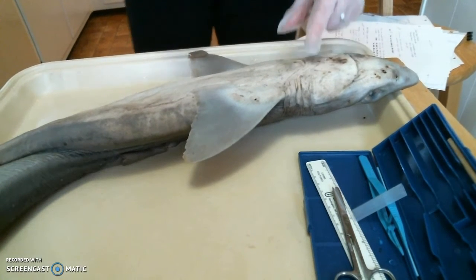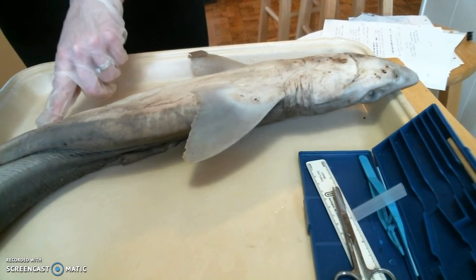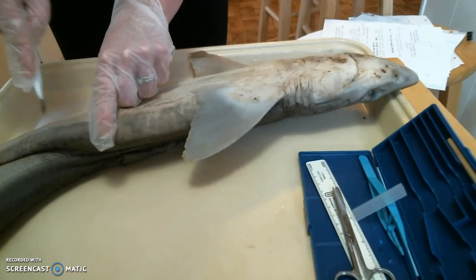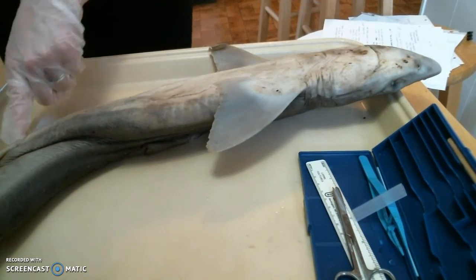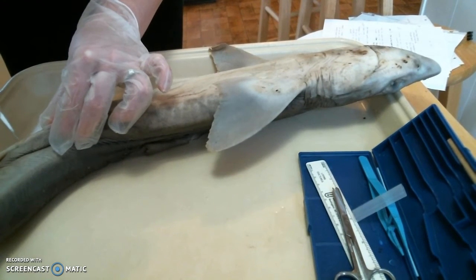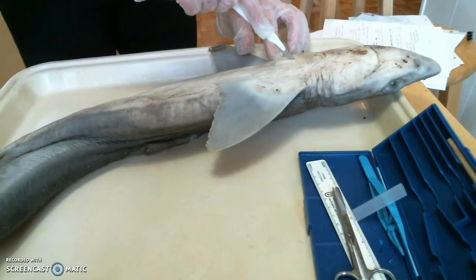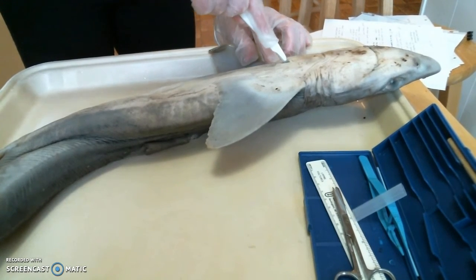We'll be okay. And then, I don't really know if I should go, I thought I was supposed to go down by the anal fin, but I'm just gonna go to here for now, I don't know. It looks all the way down to the pelvic fins, yeah, right? Like down here. Oh, I think I cut too deep on that little part right there. I don't know. Because I'm starting to see fluid come out. And then I'm going to go ahead and try to do an eye shape.